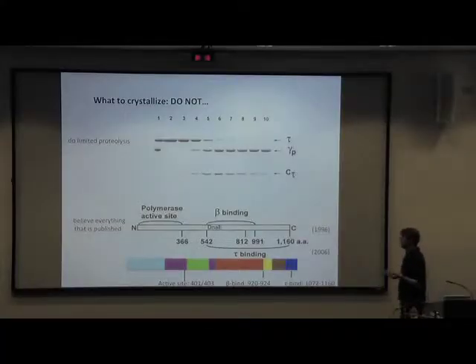And likely it has cut maybe smack in the middle of a domain, so now you've destroyed something, or it may be in a long flexible loop and it's cut in the middle and you're still left with a 20 residue flexible thing. So it doesn't really help you. And maybe, yes, there are a few nice cases that it worked in, but I wouldn't spend much time on it. Plus, if you want to do this and purify it, you put the protease on a column and really make your colleagues upset.